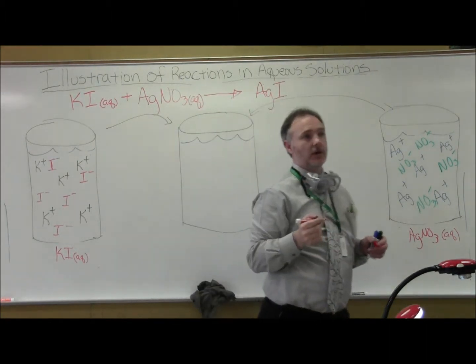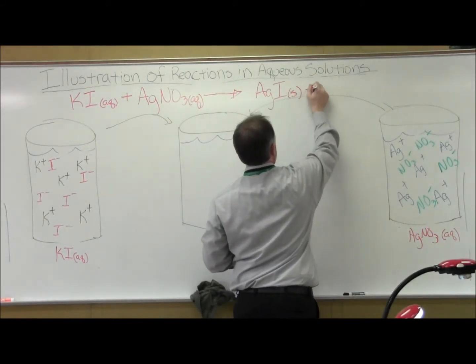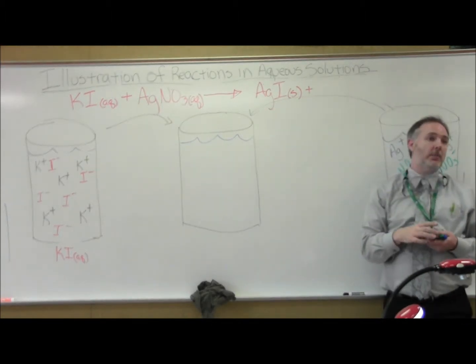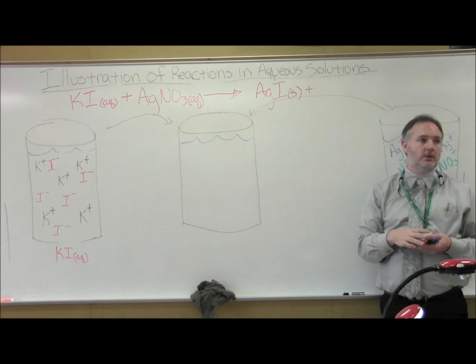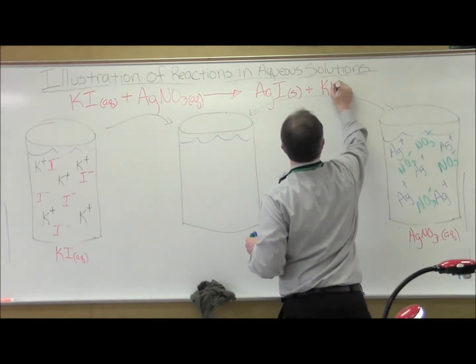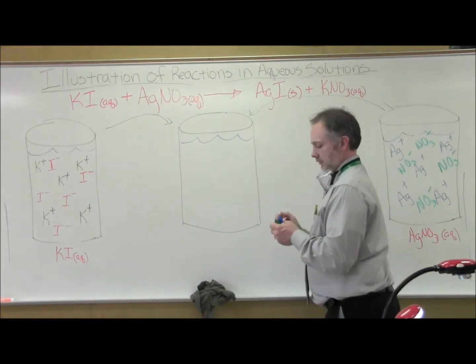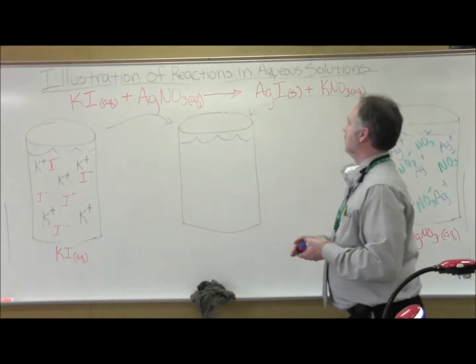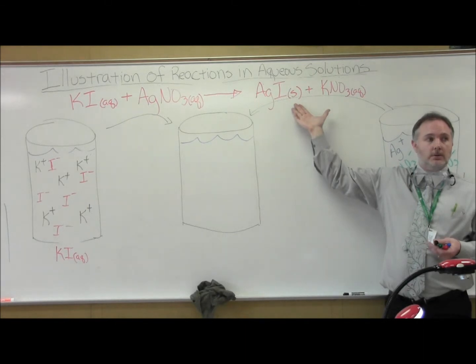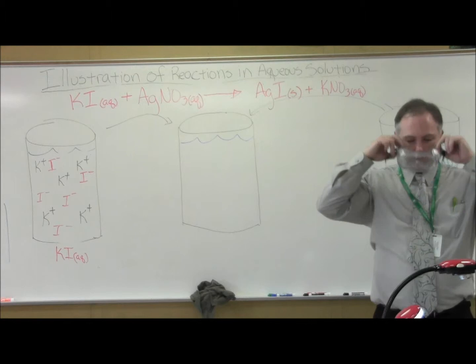And is it soluble or insoluble? The S indicated. Insoluble. All right. Now, how about my other partner? Good. KNO3. So there's supposed to be a reaction. There's supposed to be a reaction, so let's see if that's true.